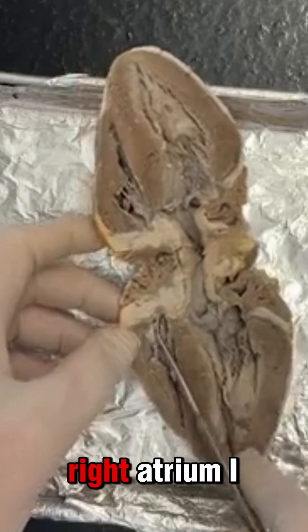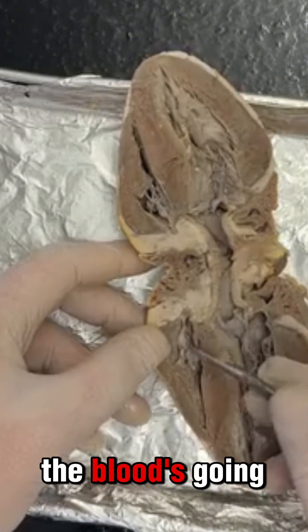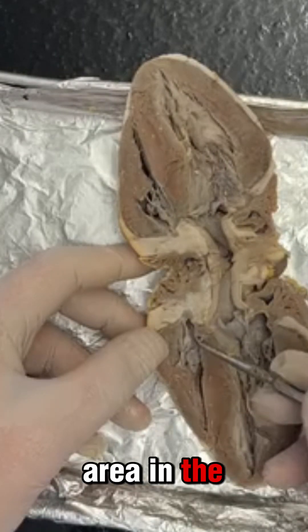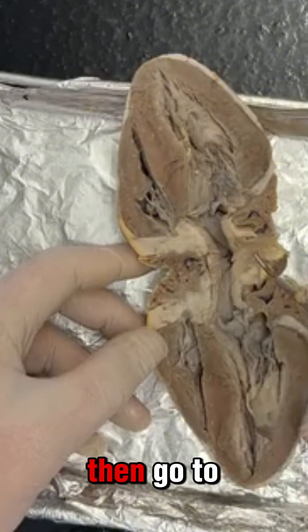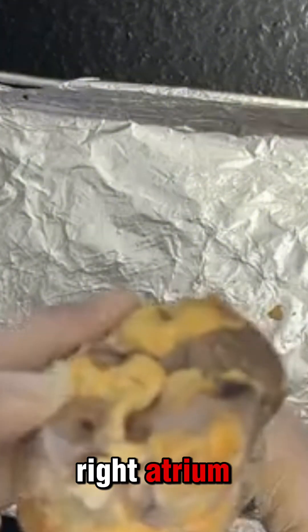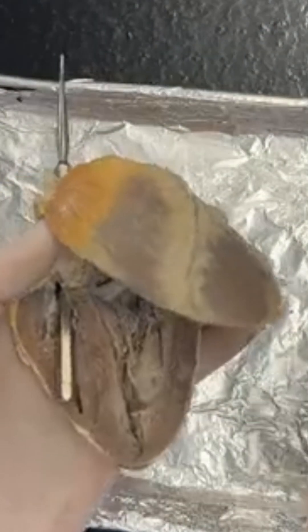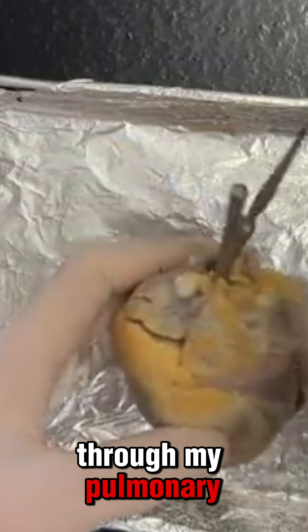Here I have my right atrium. The blood going through the right atrium is going to be deoxygenated — there's going to be no oxygen in this area — and then it's going to dump down into the right ventricle. From the right ventricle it's going to exit the heart and then go to the lungs. So from my right atrium, blood enters and gets staged until the right ventricle, and then the blood is going to leave.